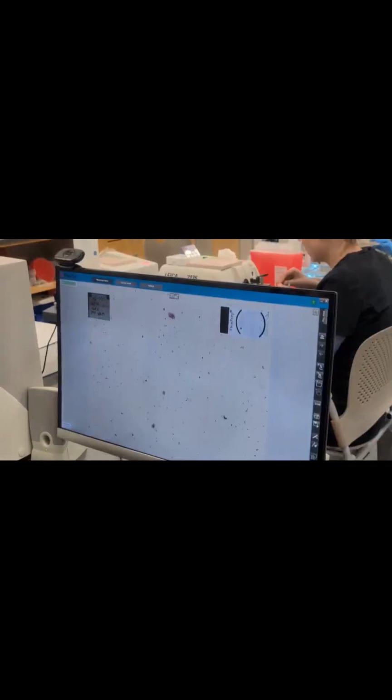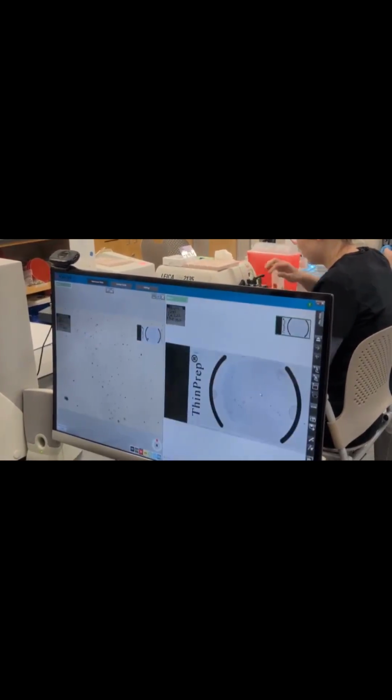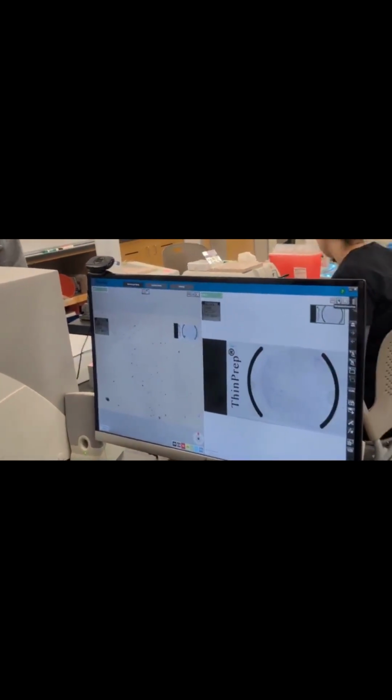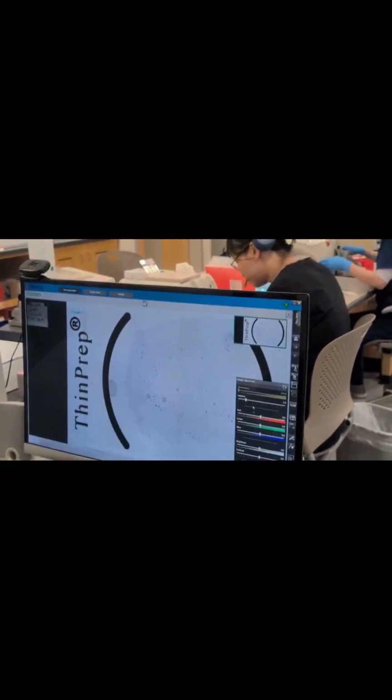So let's look at your slide. Let's see what you... Okay, and so once I was done looking at this one, I'll hit this button. And then I can hit the same exact button, but over this side. So then I can look at this slide instead.